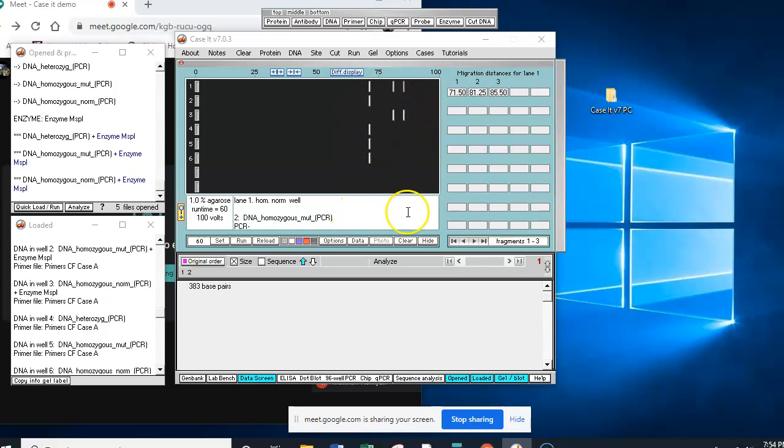If things are different, they're called polymorphisms in genetic terminology. And so what we did is we looked at restriction fragment length, because that's what these are. These are restriction fragments, and they're of different lengths. And they're different, so they're called polymorphism.